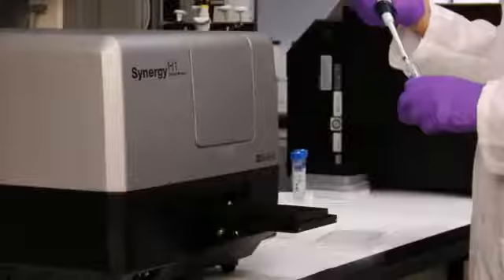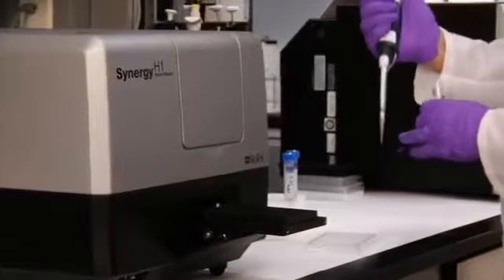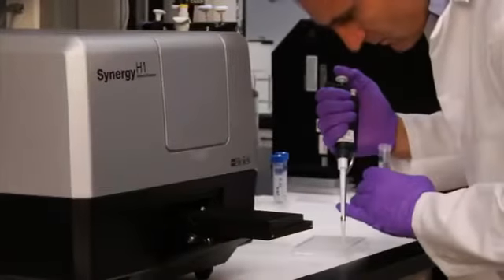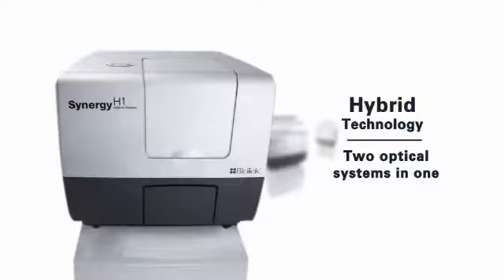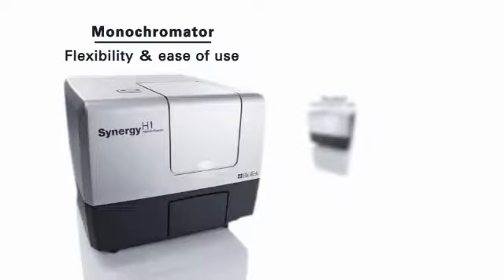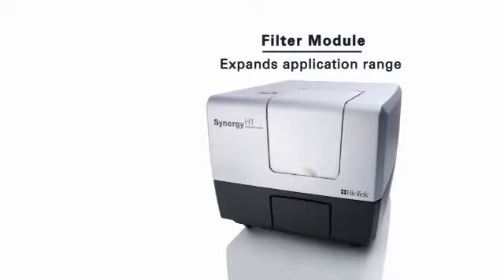This unique patent-pending combination of monochrometer and filter-based optical systems covers a very broad range of applications in a compact, cost-effective instrument. Monochrometers provide ease of use and flexibility, while the optional filter module greatly expands the application range of the instrument.